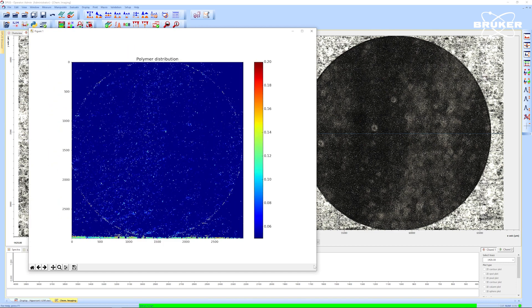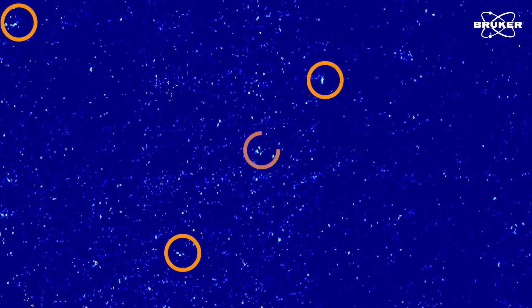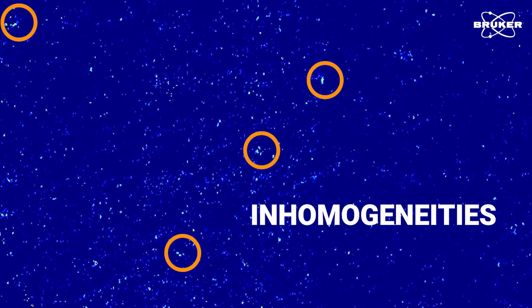By utilizing two wavenumbers for the chemical image creation, we access exceptional chemical contrast and also suppress any unrelated surface effects that would show in a single wavenumber image.